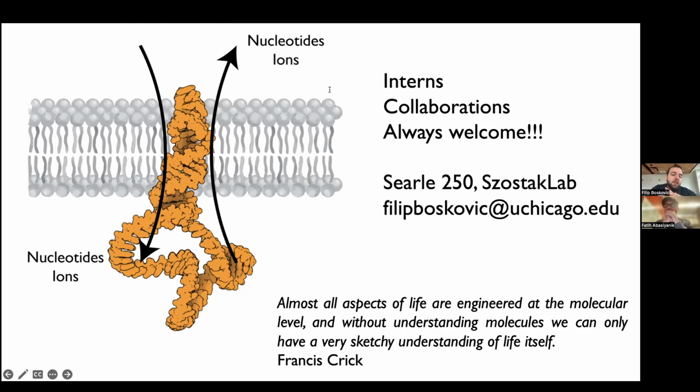Can you also select for a sequence at the 5' end of a sequence? Assuming that you're talking about DNA, because DNA and RNA sequencing go in a different directionality. So RNA sequencing is from 3' to 5' just because the motor protein is different. And then DNA is 5' to 3'.